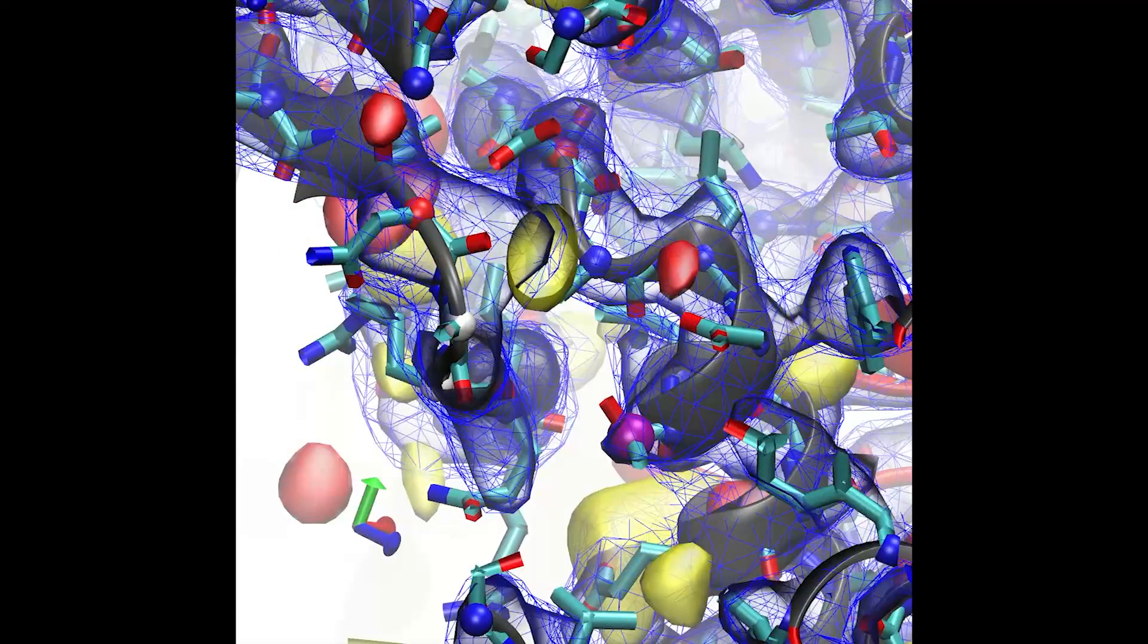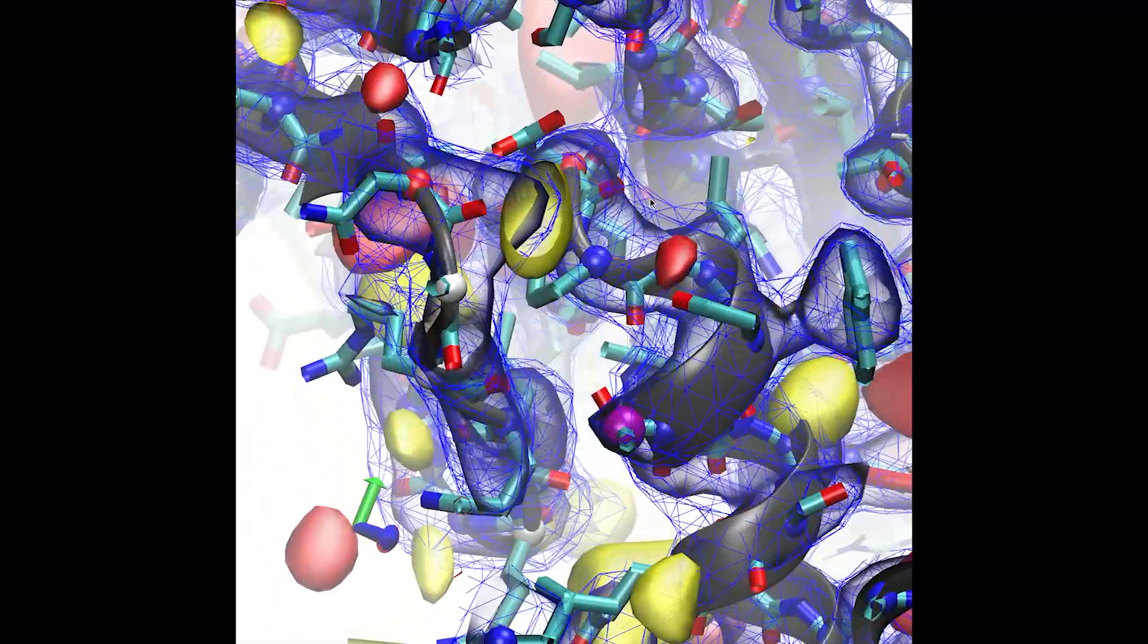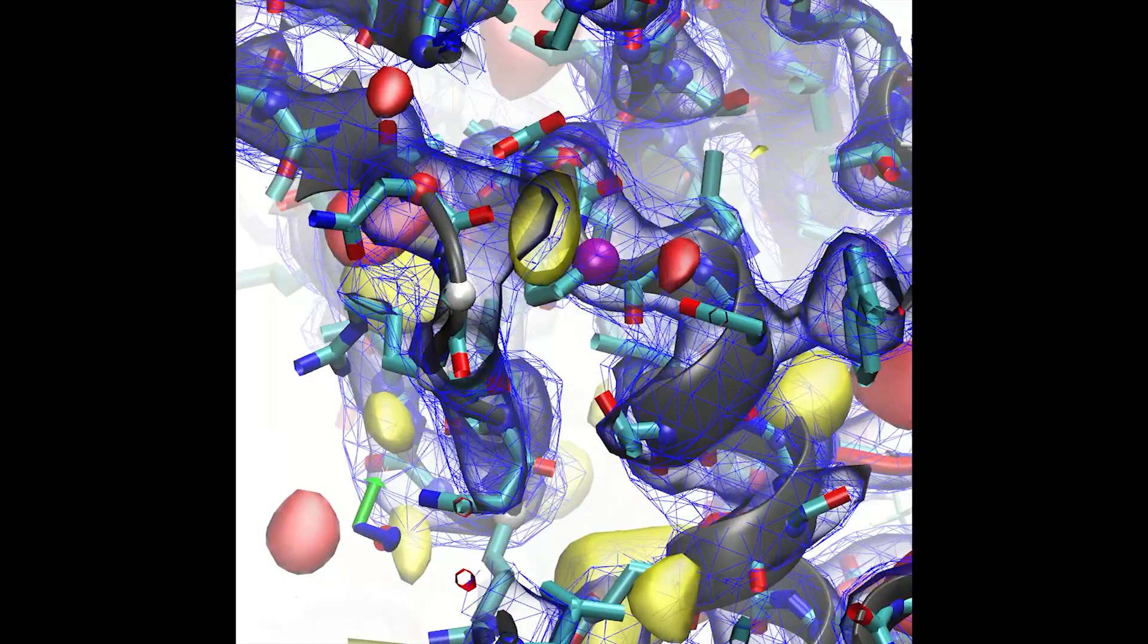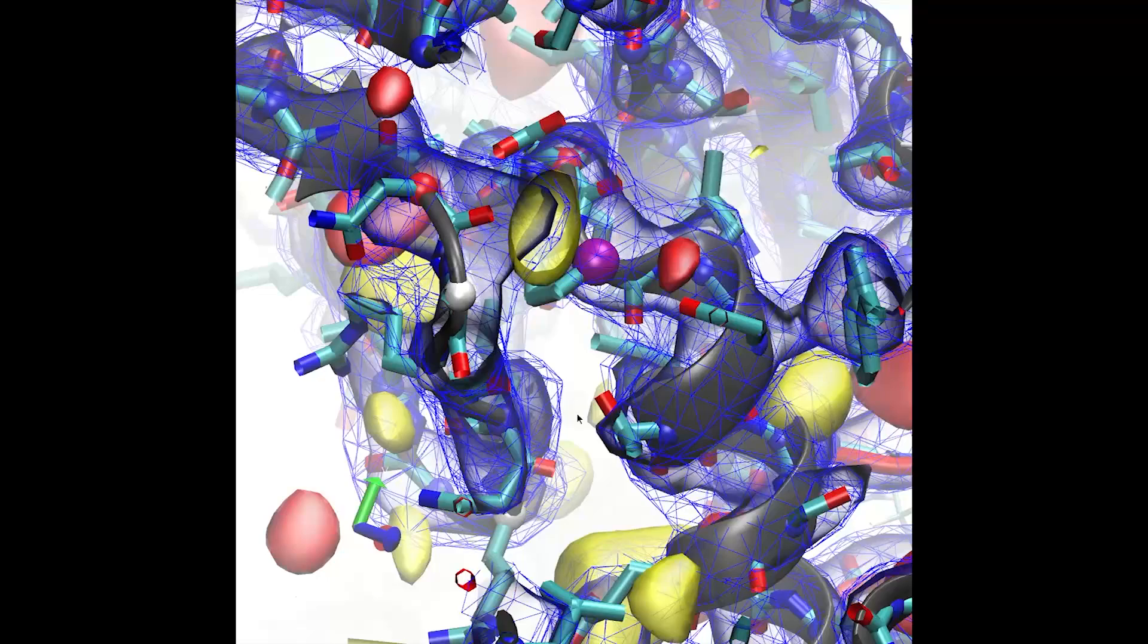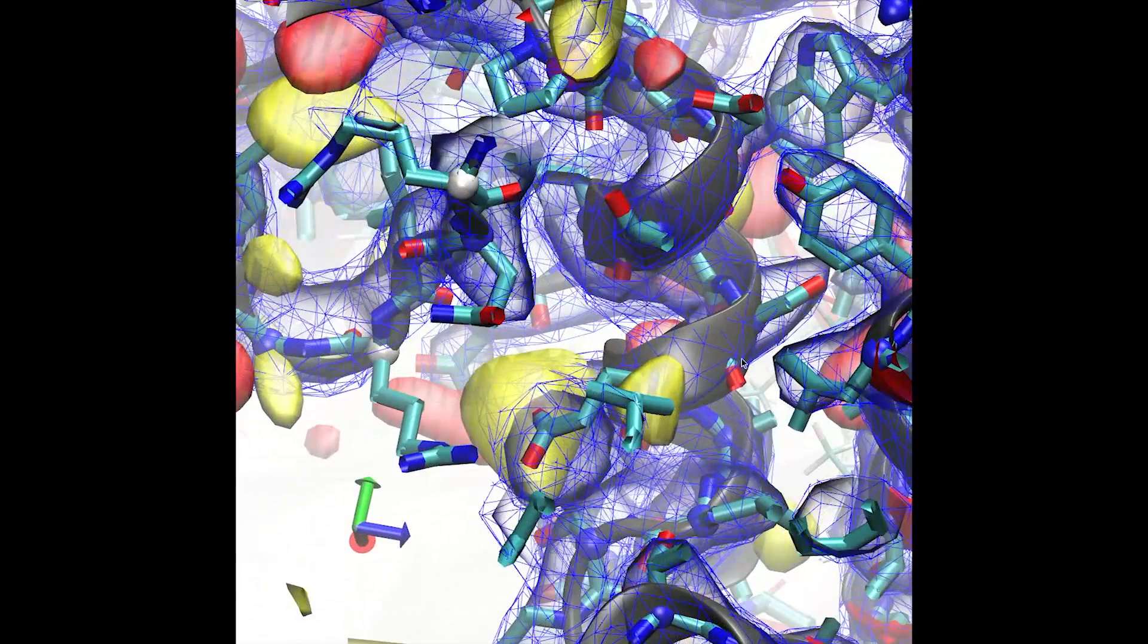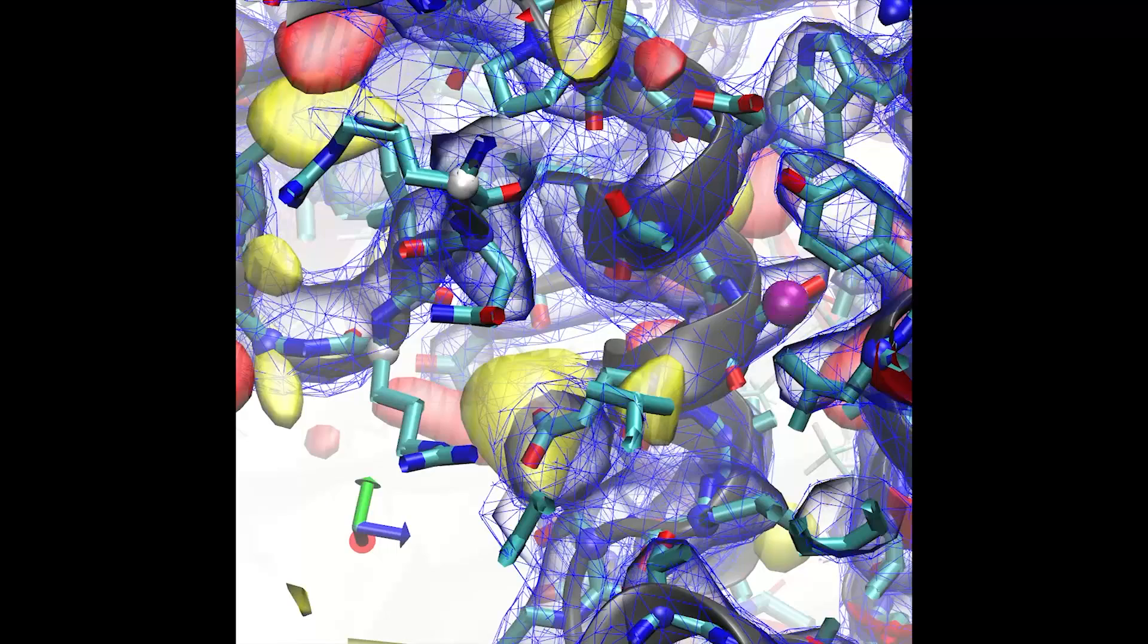The simulation can be paused at any time to take stock, save snapshots, or as I'm doing here, define tasks for the helper scripts. In this case I'm defining this short region as an alpha helix, and the simulation will continue pushing towards this conformation until I tell it to stop.